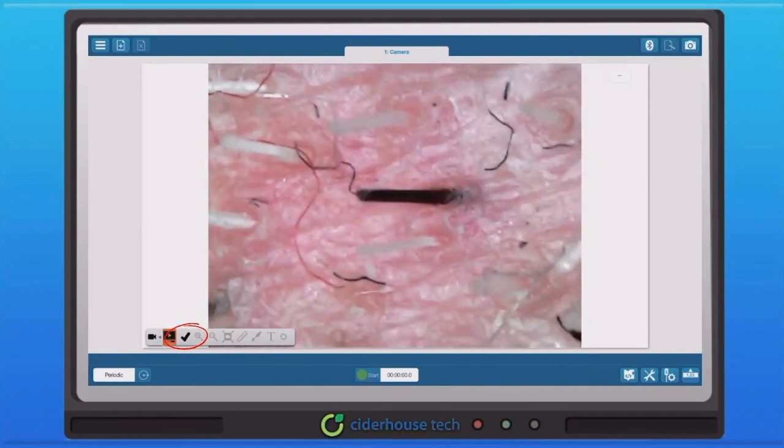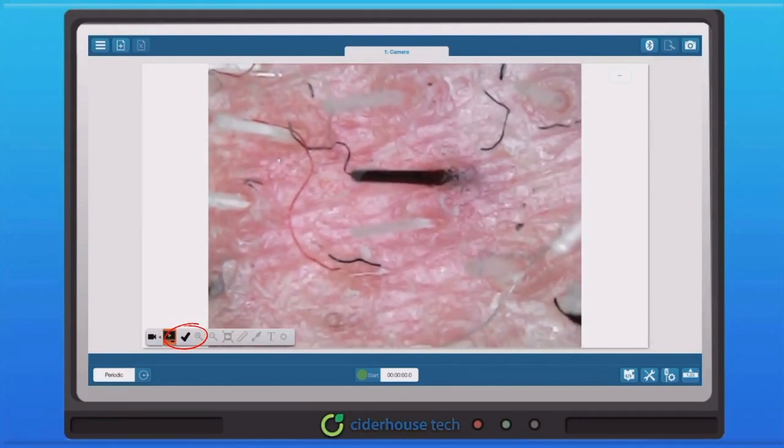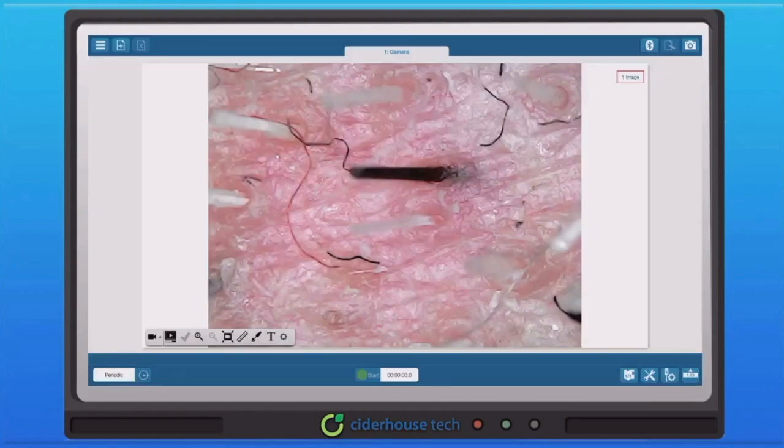Once the image is focused, we can press the capture button. Now we can begin to annotate the captured image. We can zoom into the image further, if required. First, we will take measurements. It is possible to change the color of the ruler.